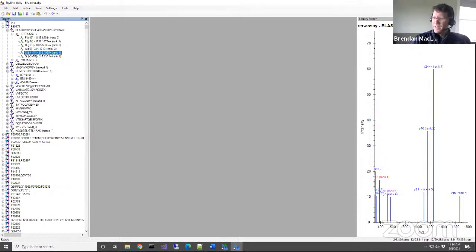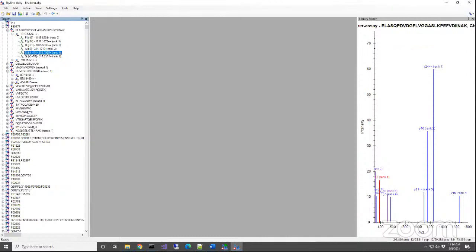This sounds promising. Small additional question: peak boundary placement. After you take a transition from not being quantitative, if you go through peak picking again, will it consider those transitions for defining the peak boundaries?